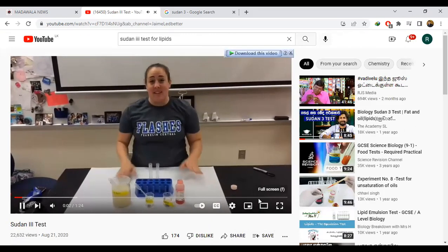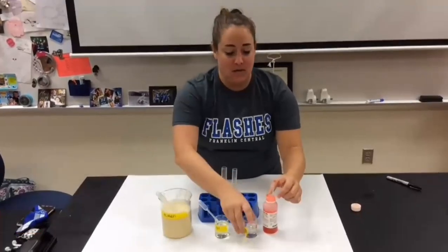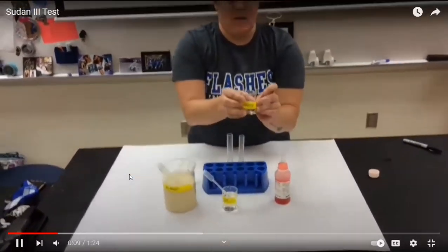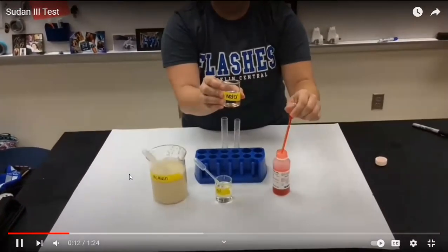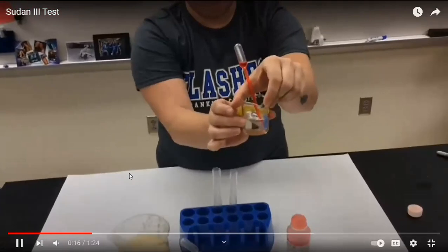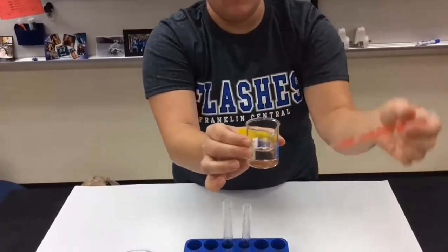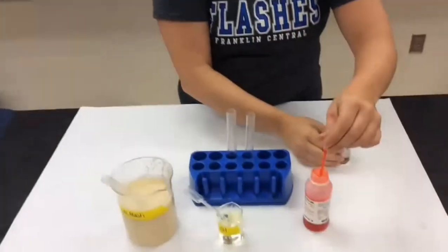The Sudan 3 test, so we're testing for the presence of lipids in our food. If you notice, I have a beaker of water. I'm going to take my Sudan 3, and when I put it into the water, let me move this around so you can see it. When I put it into the water, the Sudan 3 dissolves in the water. You can't really see it anymore. The water is turning slightly pink just because I put so much in it.